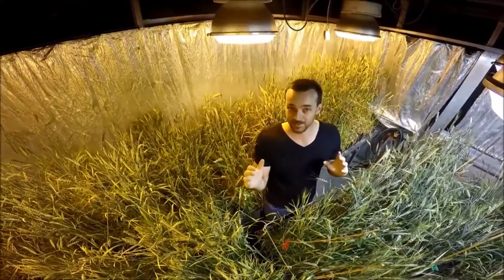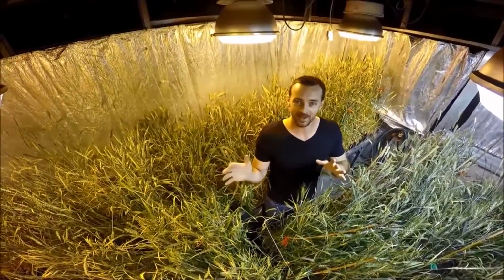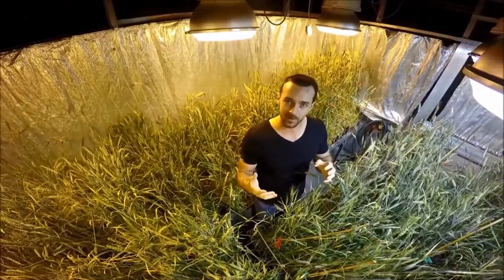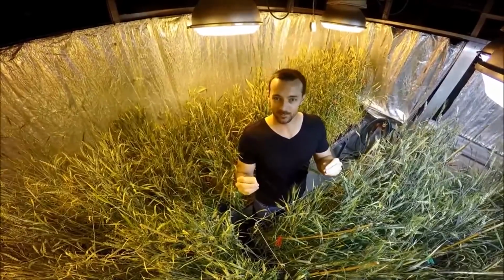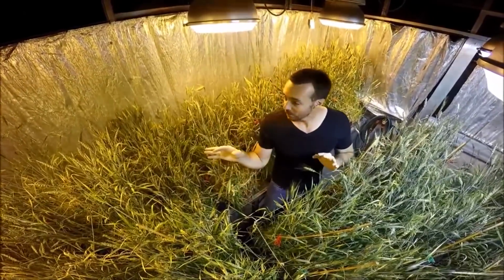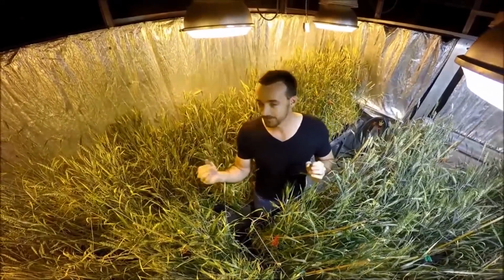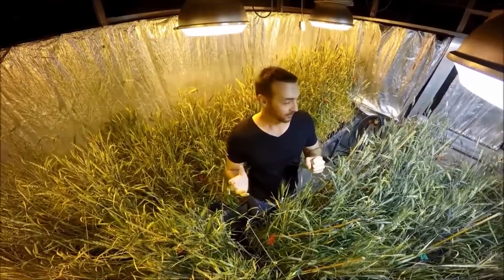In this glass house, we have about 4,000 F2 plants. It's all trying to develop recombinant inbred mapping populations to map new resistance genes to rust. So you can see all around me the diversity in terms of plant height, maturity. So these plants are growing super fast.